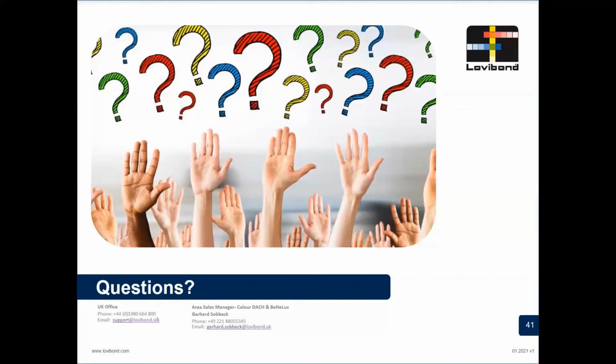What we're doing with the N value is, probably best to think of it in the visual instrument. When I'm looking at my two fields of view, I have my sample and the color I'm matching. Now I think in my first step with my red and yellow, they're roughly the same color, but my sample is actually darker than the match color, although I think they're roughly the same color. So my neutral value is actually dulling down my match color. I'm trying to make my match color the same brightness as my actual sample so that I can get a better color match, because in a Lovibond system, if you've got the brightness the same, then it's far easier to get the color matching correct.